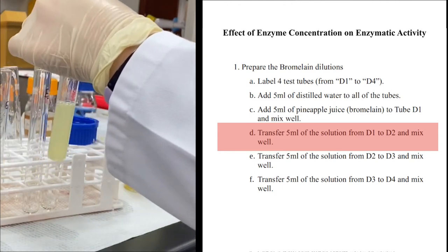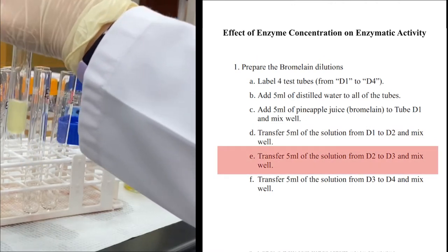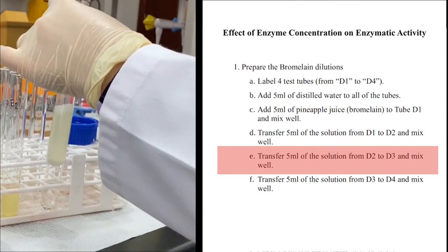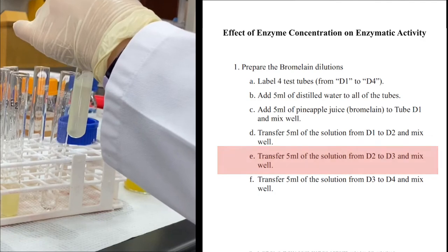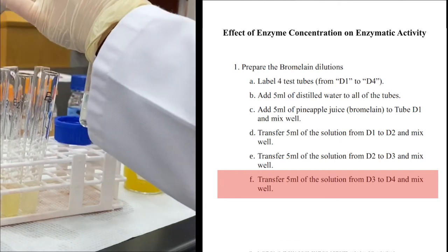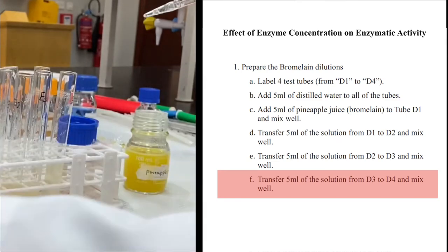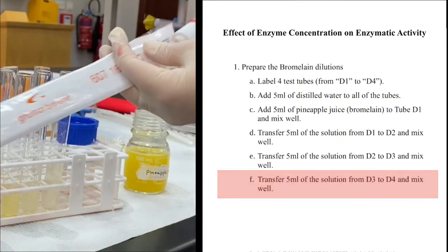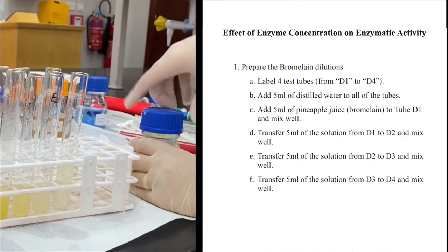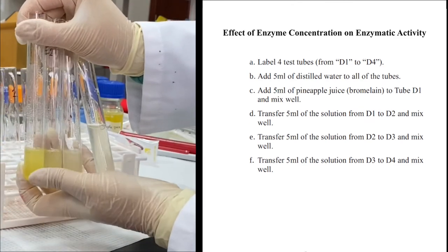The total dilution in the second tube becomes 1/4. Then I take 5 ml of this diluted tube to the third tube — this is dilution 1/8. And continuing the same process, the fourth tube reaches dilution 1/16. At this step I have only prepared different dilutions of the enzyme; I have not started the experiment yet. The different colors of each dilution are clearly visible.